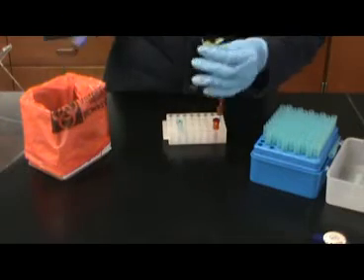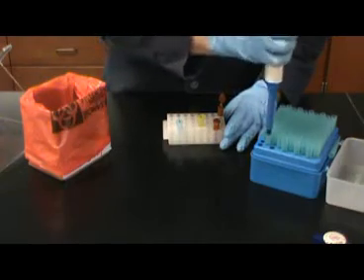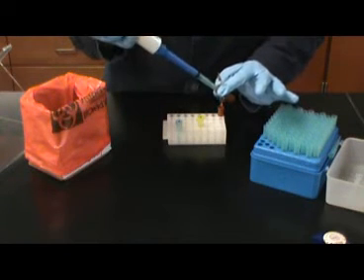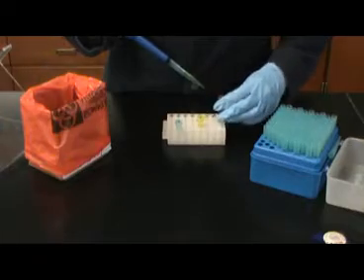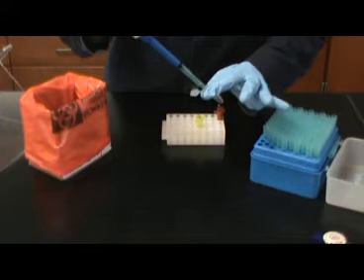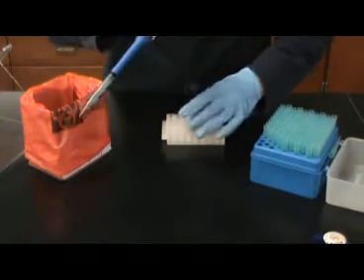It is important at this stage of the experiment to always handle the negative tube or control tube first. This will help prevent contamination of your control with the already transformed bacteria cells found in the positive tube. After the transfer of the nutrient broth has been completed, you should gently tap the tubes to mix the E. coli cells with the newly introduced nutrient broth.